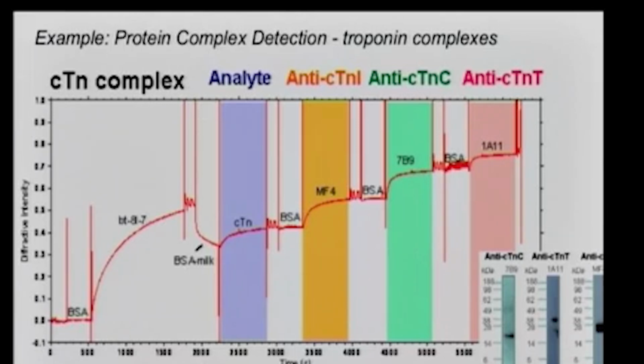So it's almost a multiplex assay, except it's all on the same protein. Same protein. And again, each point here is the introduction of another thing. So the introduction of the troponin, and then the introduction of all the different antibodies to the different parts of it.